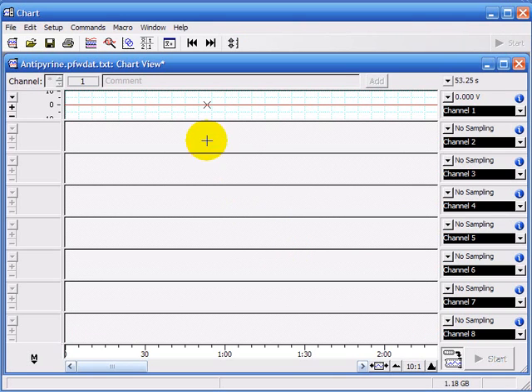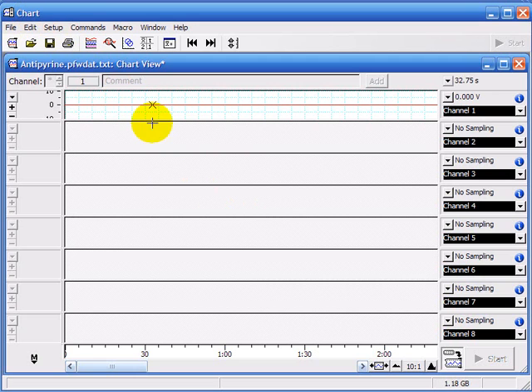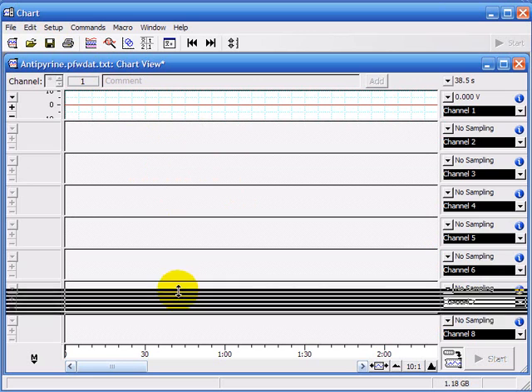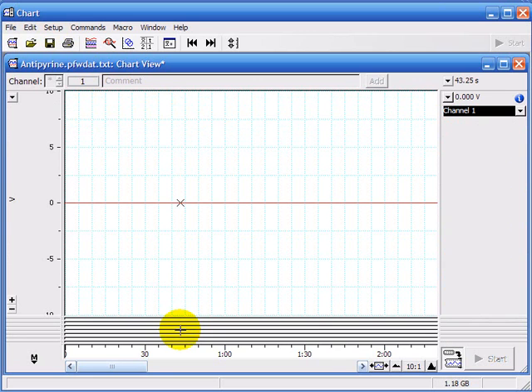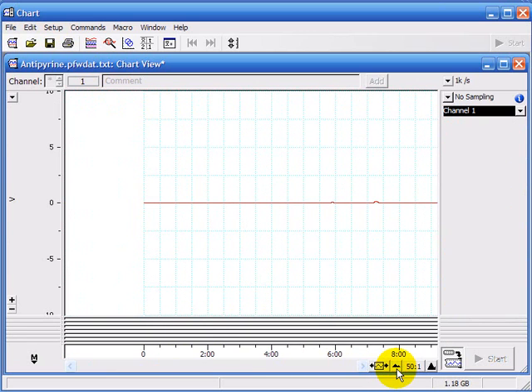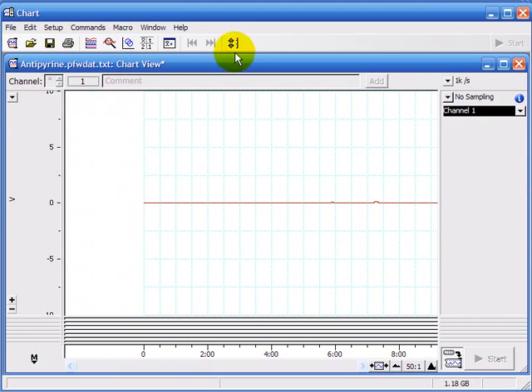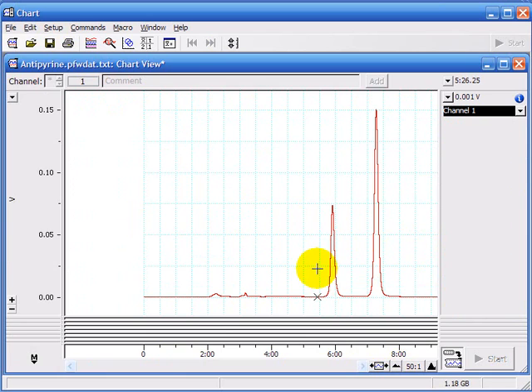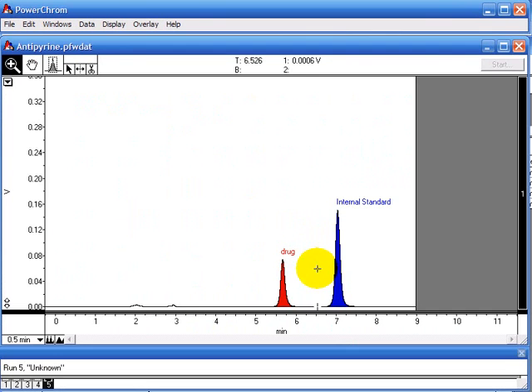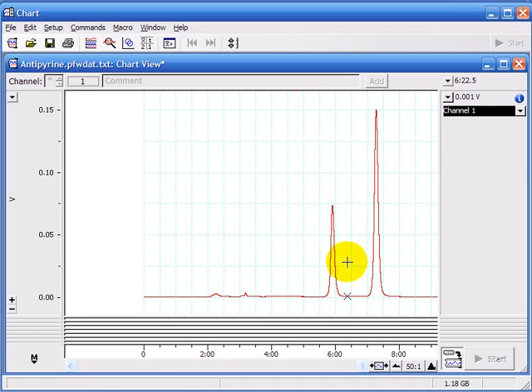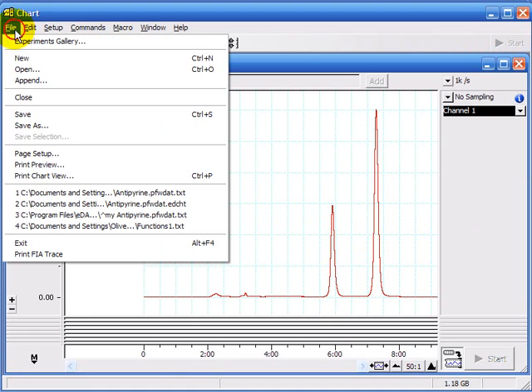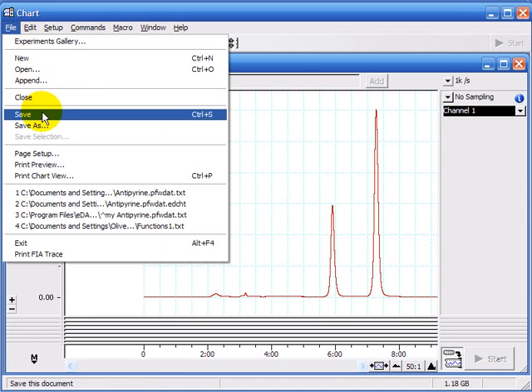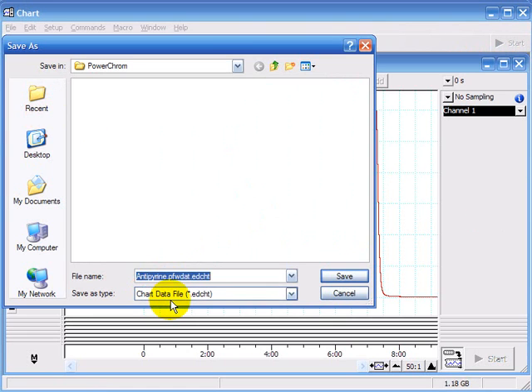And then you can see our data has been opened up in the chart software here. It's only in channel 1. Drag this down. Contract the x-axis. And if I click on the auto scale, you'll see that here our data in the chart software is the same data that was in the PowerChrome software. All you need to do now is save your file as a chart data file.